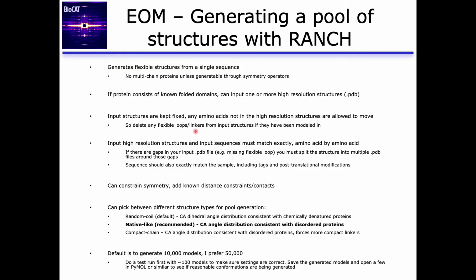So if you have, for example, a PDB, a crystal structure where you've modeled in a particular conformation for a flexible loop or linker, or maybe a flexible N or C-terminus, you want to delete those so that Ranch is free to move them.